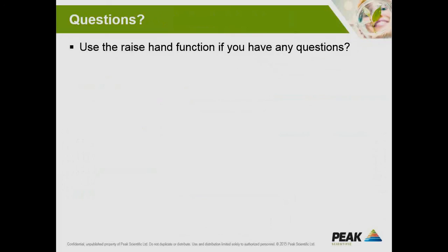Sure. The next question was on the longevity of filters. Generally, as Ed touched on, with routine maintenance, it's every 12 months. For the nitrogen, the zero air, and the compressor, filter changes are required every 12 months. With our hydrogen generators, we have two options, the hydrogen trace and the hydrogen standard. Both need the deionizer cartridge changed every 6 months. On the standard models, it uses silica gel to dry the gas, and the silica gel will saturate depending on usage, how much flow and how much pressure is being used.